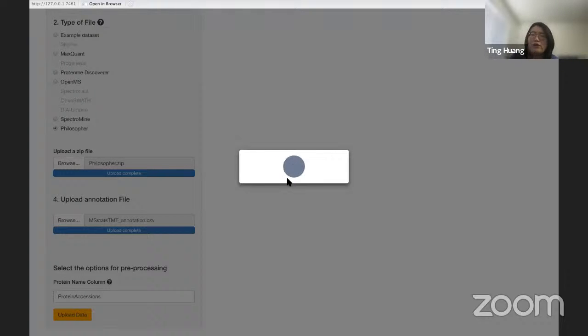After we select the best fraction for the overlapping peptides, we combine all the fractions. Inside this step there are also some filtering steps. For the tools, if there are Q values, it will apply Q value filtering, like with FragPipe here, it will apply a default identification score filter.